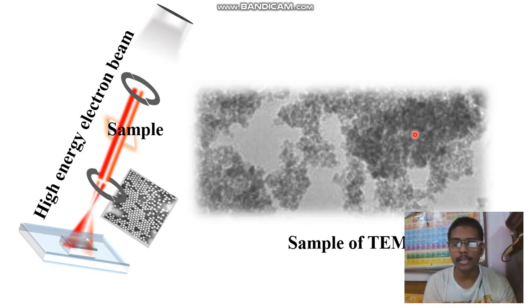So how will you get the exact 3D image of the protein? What normally we do is we prepare the specimen in the specimen sample chamber of the electron microscope, and then, by moving the projection screen at the bottom of the microscope, we take images of, let's say, 15 to 20 areas of that specimen.